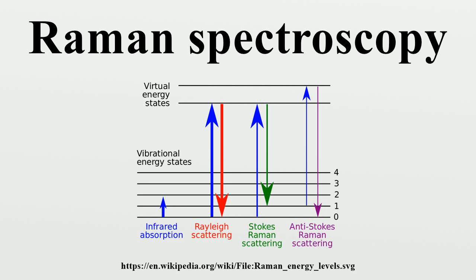In solid-state physics, spontaneous Raman spectroscopy is used to, among other things, characterize materials, measure temperature, and find the crystallographic orientation of a sample. As with single molecules, a given solid material has characteristic phonon modes that can help an experimenter identify it. In addition, Raman spectroscopy can be used to observe other low-frequency excitations of the solid, such as plasmons, magnons, and superconducting gap excitations.